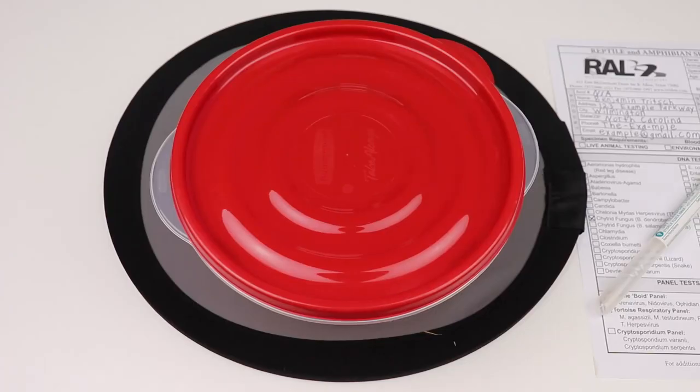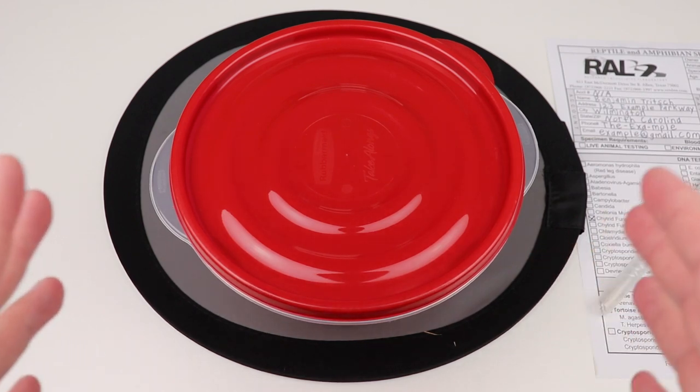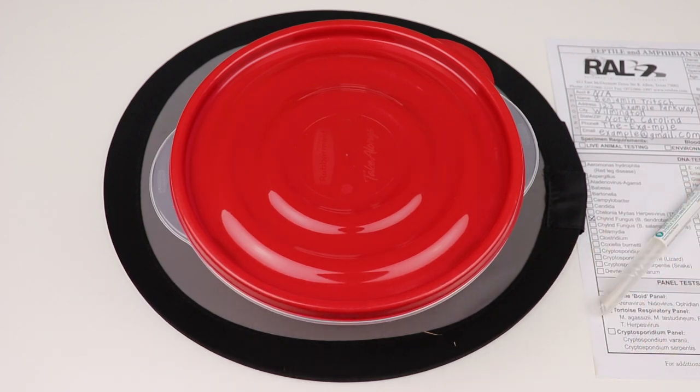In today's video we're going to be looking at how to test amphibians for chytrid fungus. This video is going to focus on frogs and toads, but you can apply a lot of the same information to salamanders as well. I'm not going to go in depth on what chytrid fungus is or why it's important — this video is purely on how to test whether or not your animal is infected.